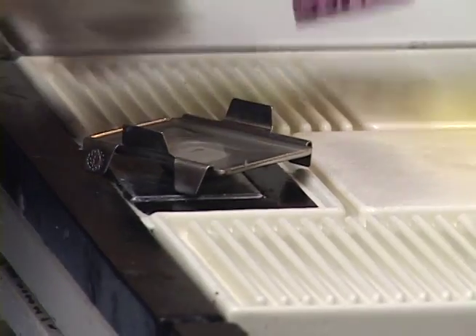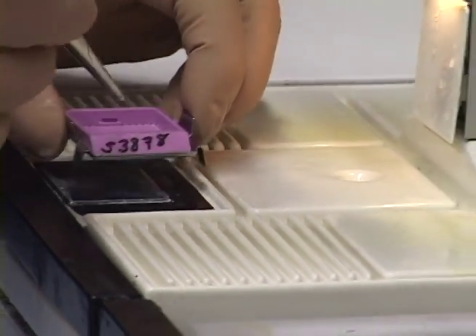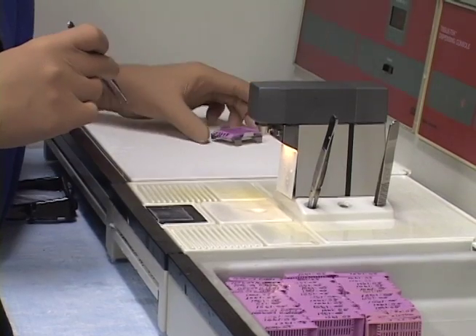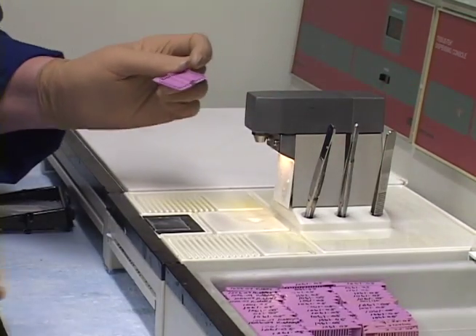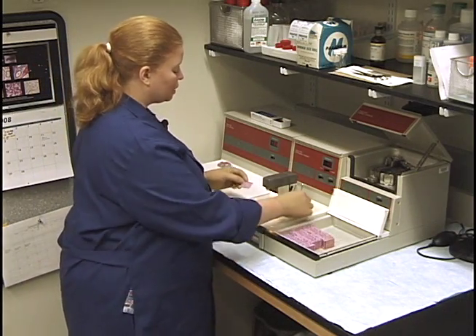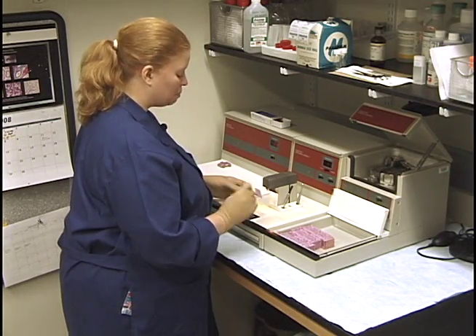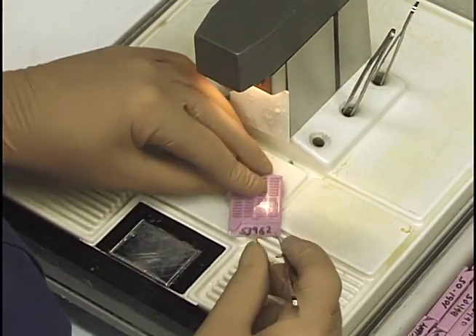I put the cassette lid on top and add a little more paraffin just until I can see it. I make sure there are no air bubbles, then put it for its final chilling. I don't throw away the lid right away because some samples are so tiny you could miss something — like an epididymis in one of the corners. I give it a look, then throw it away.